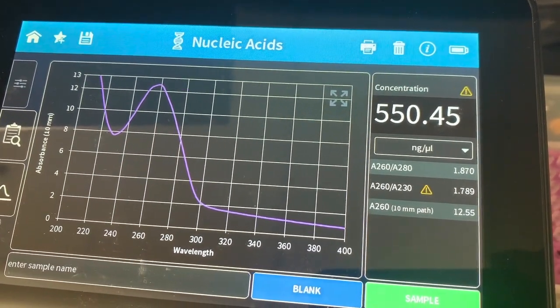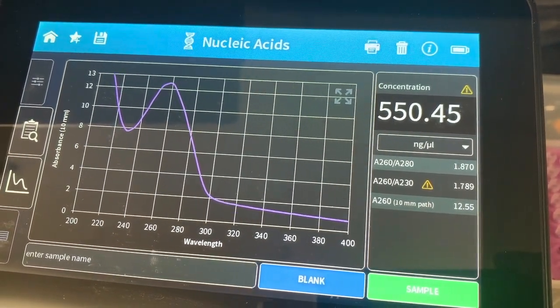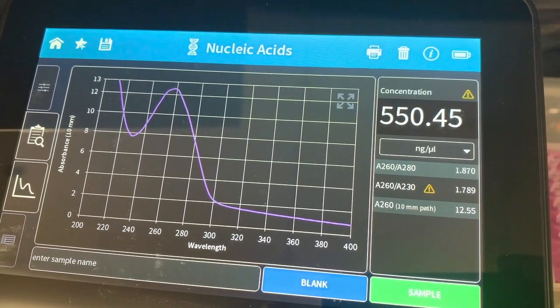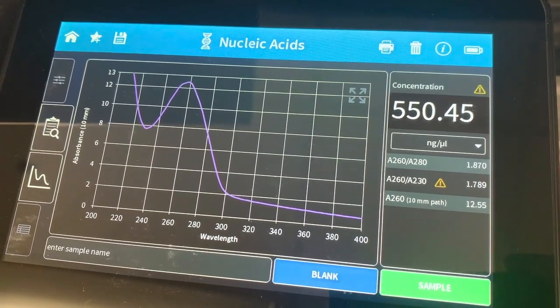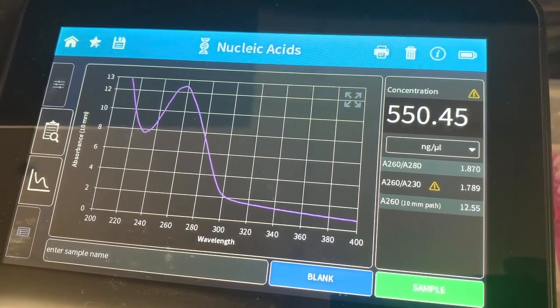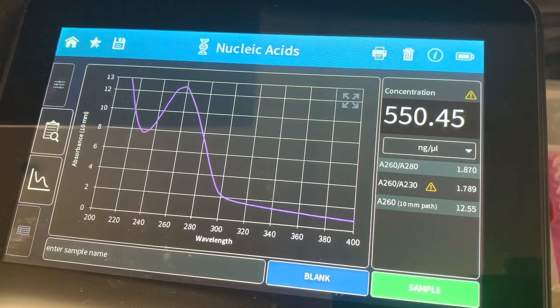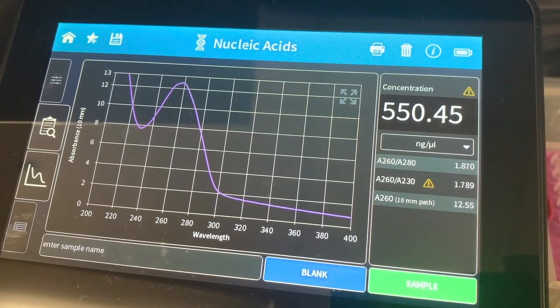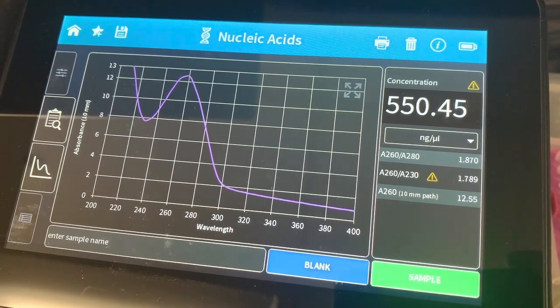You can see that for mine, the top value is 1.87, but the bottom value is a little bit under 1.8. That's okay, but we'd prefer to have it above 1.8. And what those values tell us is how much we have of our DNA relative to other types of impurities like RNA or protein or different chemicals in the solution. And you can sometimes get a 260 over 230 value that's out of range a little bit because of some of the chemicals that are in the mini prep or purification kits.